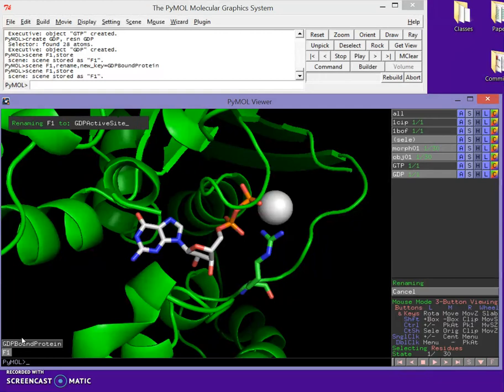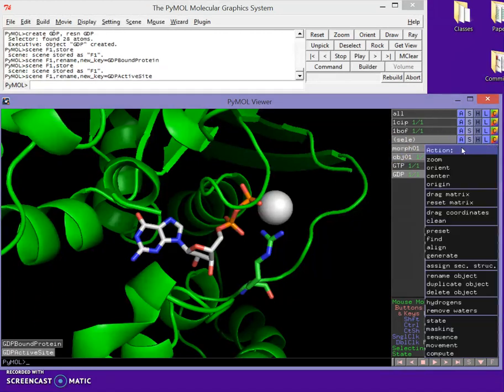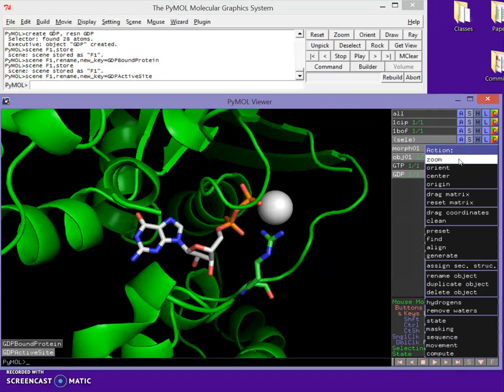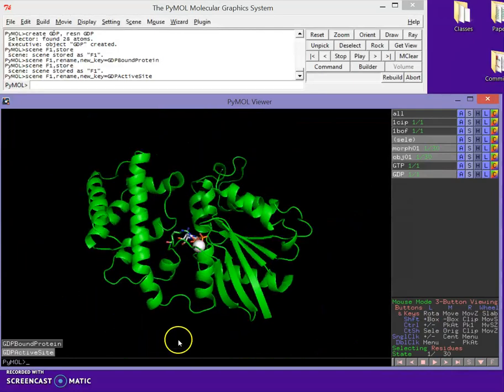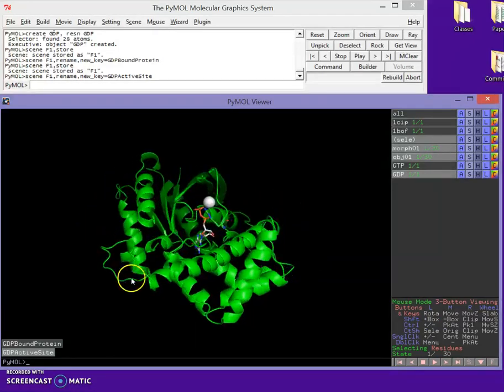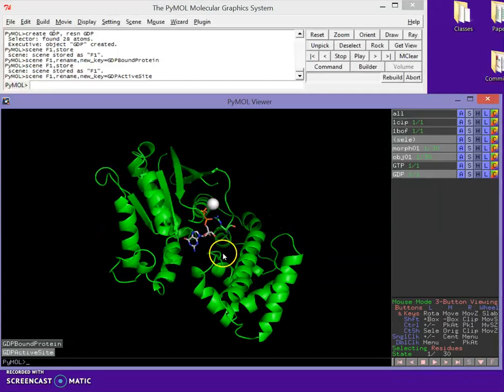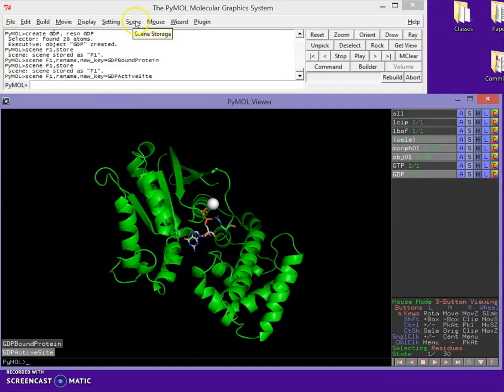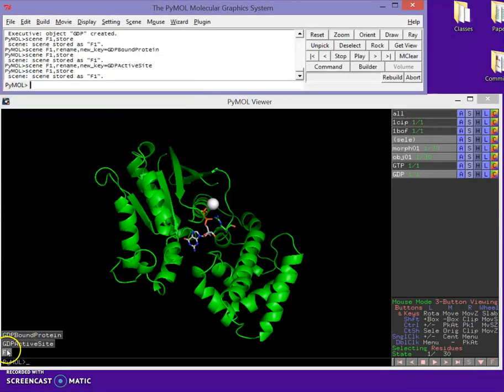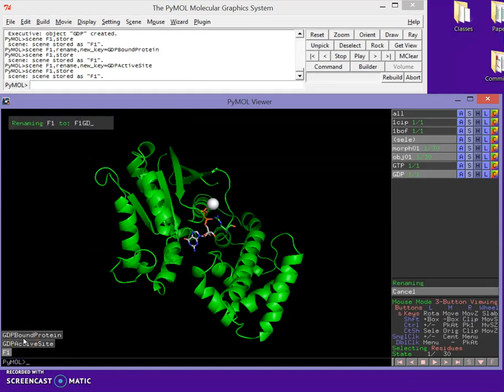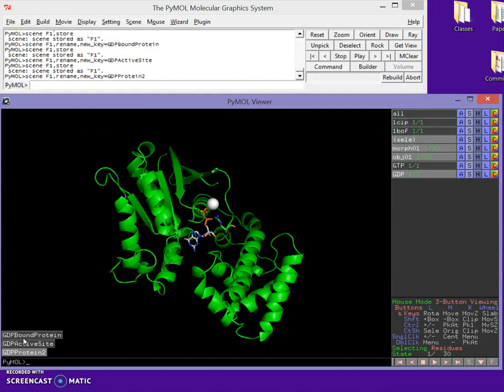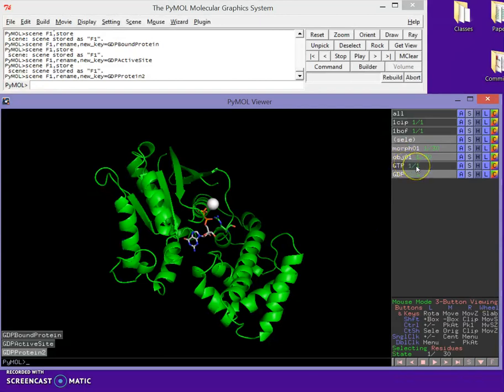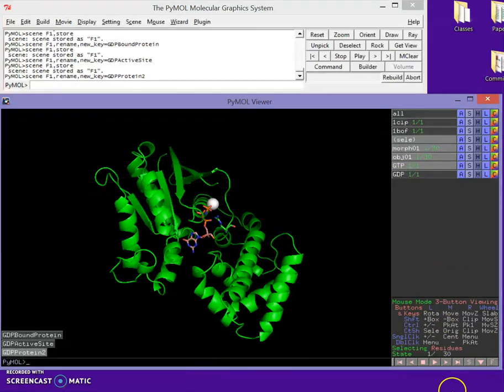Now I want to zoom back out to watch the motions, so I'll orient back on the whole protein. PyMOL will interpolate any connection between scenes when we program the movie. I'll store this as a scene — we'll call it 'GDP protein 2'. Now I want to switch to the GTP-bound form, so I'll turn on GTP and turn off GDP. I also want to make sure all my residues are in state 30.